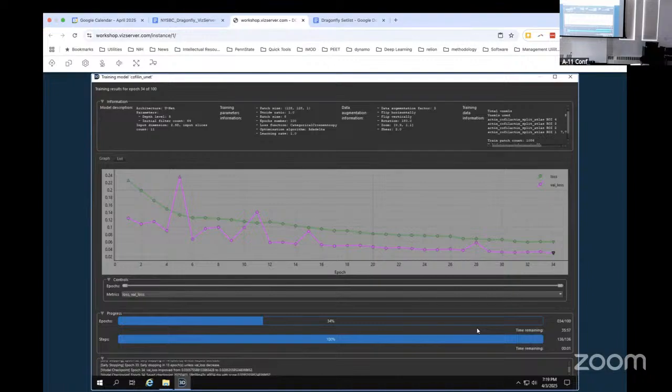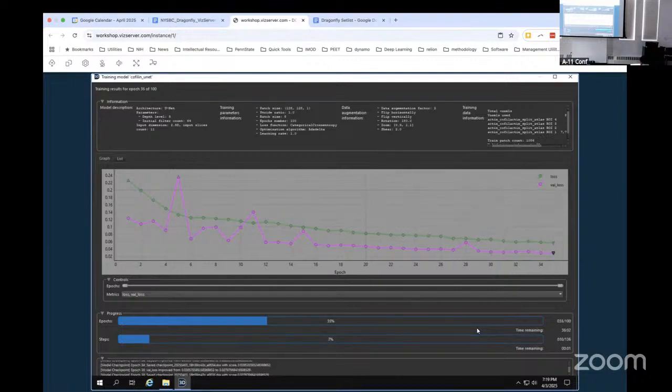Do many of them have magic features? I can get it to segment, but I don't know the missing bits. Dragonfly does that, like auto segment on a mirror with outer layer tracking. But I can't get it to make a full circle. Are you doing it like this?